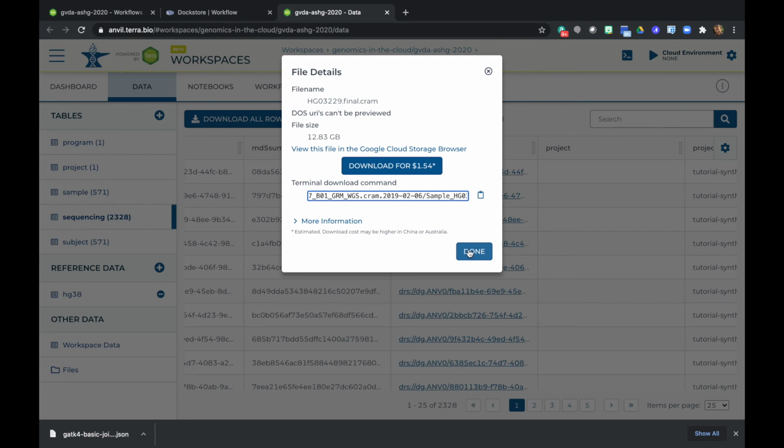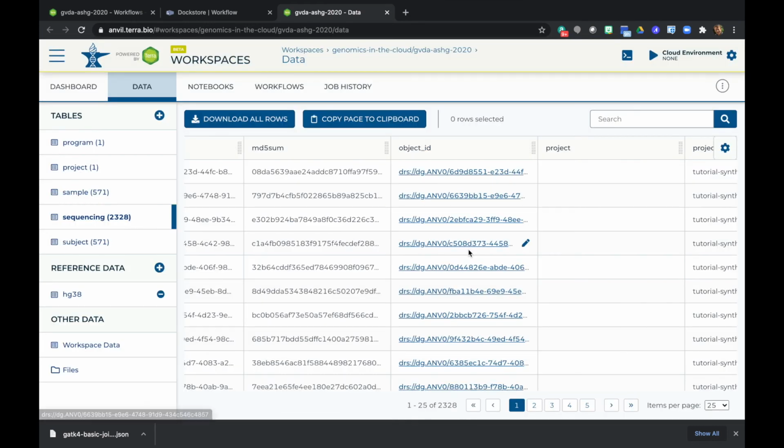This is the final curveball in working with this dataset. When you imported the data from Gen3, you don't actually get any direct file paths in the metadata in here. You get file names, but not their actual location. Instead, you get what's called a DRS object identifier, which acts as a sort of alias for the real file paths.